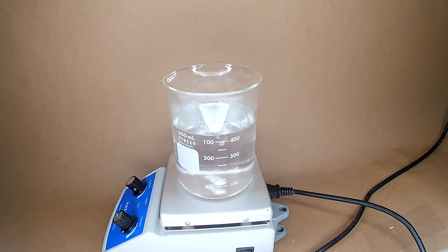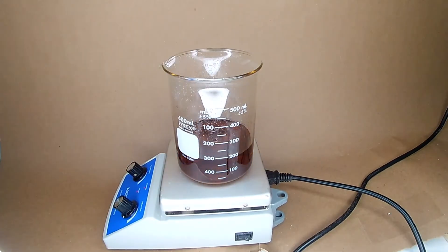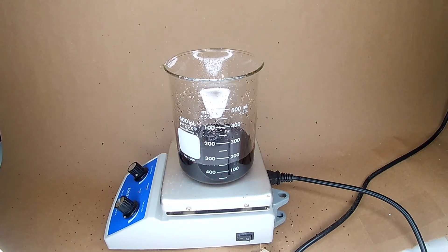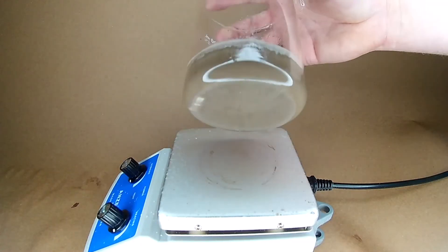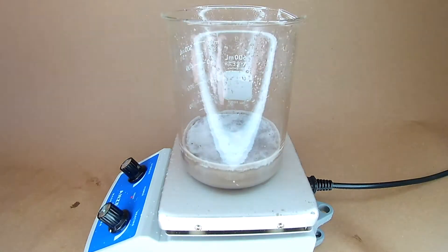First, I evaporated it to increase the concentration. When I came back the next day, the solution had solidified, so I melted it back down.